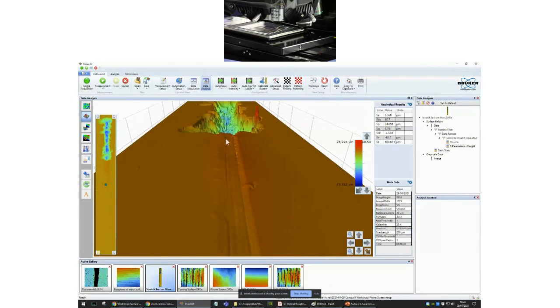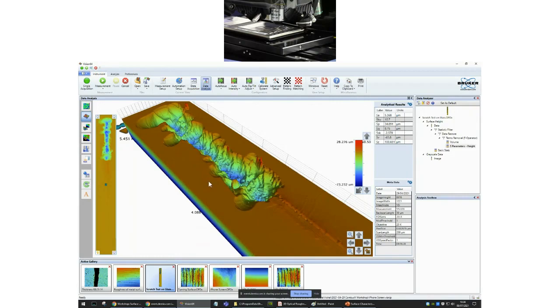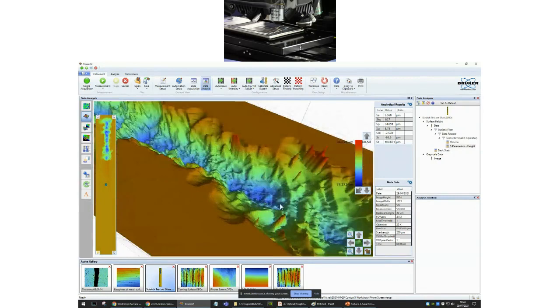And then at some point, the glass just cannot bear the weight from the pressure from the indenter. And all of a sudden, it starts to fracture and break apart. And this is what you're seeing here. Actually, Sam showed some examples of this earlier on, albeit with a different technique as they were measuring here. But you can see exactly what this looks like.